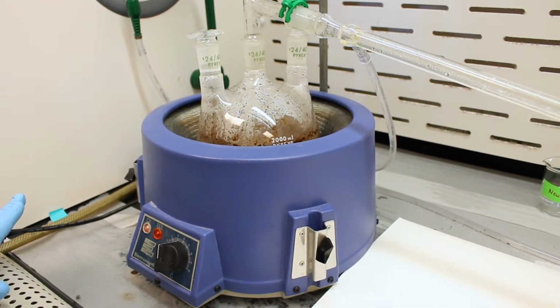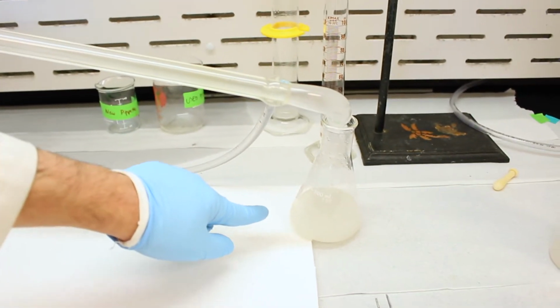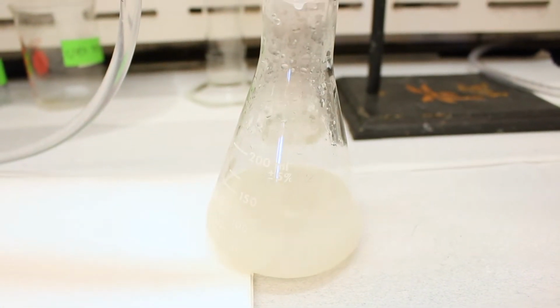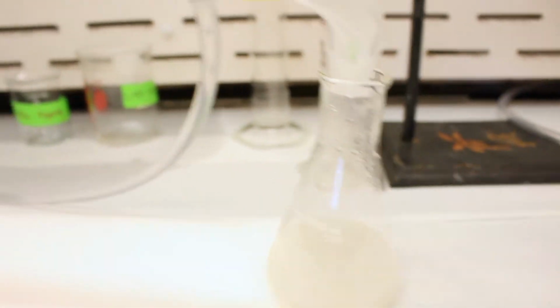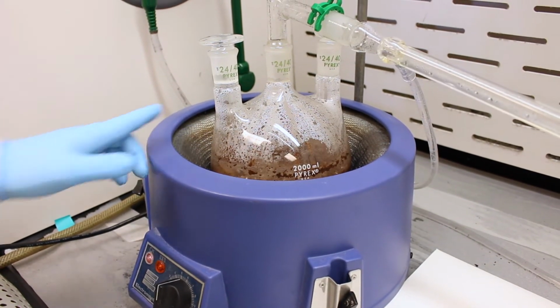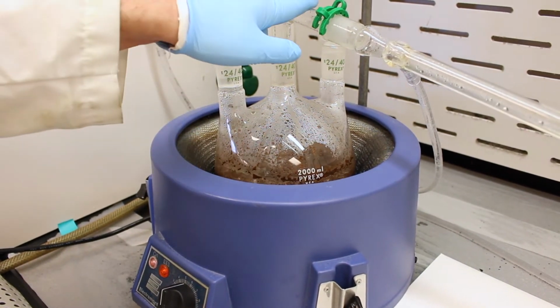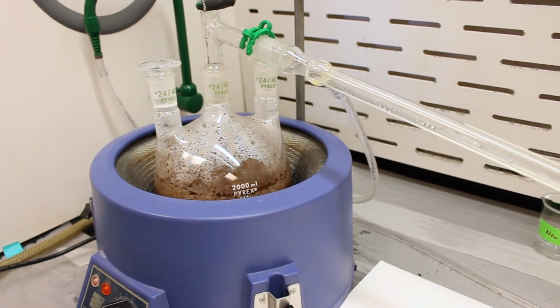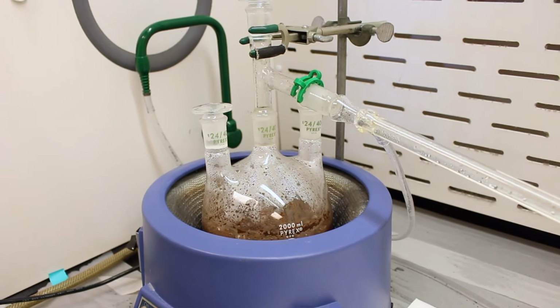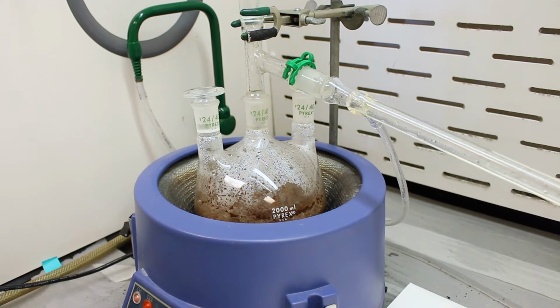Alright, here's an update. Our attempts to stop the boiling flask from foaming up did not work, and as you can see in our distillate, a little bit of foam and allspice made it over, which is why it looks a little brown. To fix that problem, we have transferred the boiling mixture of allspice and water to a bigger flask, and our foaming problem is now under control. So this apparatus is, for the most part, essentially the same. You have a boiling flask here, a still head, and a very long condenser, and we are now getting distillate at a very fast pace. We were really struggling to collect distillate at a fast pace, but now we've got enough. And perhaps in half an hour, we will be done.